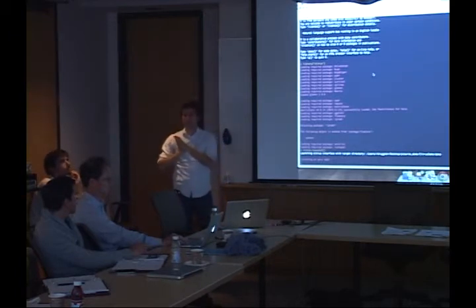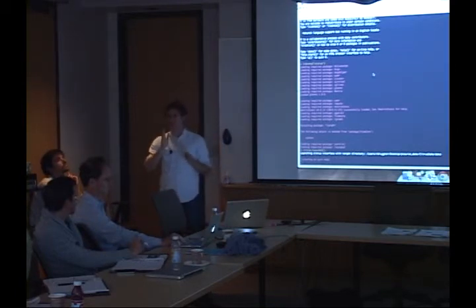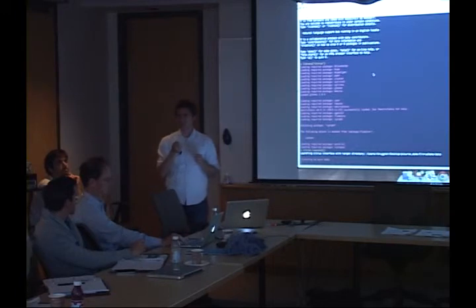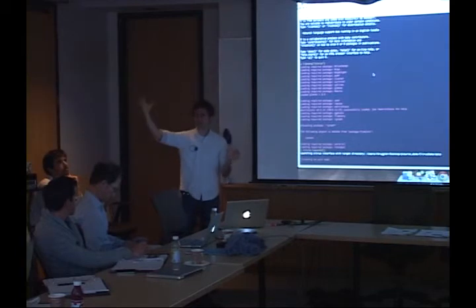I haven't been able to characterize this fully in a statistical manner. My current intuition is that when you're working with things in very high dimensional space, that day-to-day variation actually doesn't make a huge difference in the way things cluster, because the clusters that you're identifying are so unique in this high dimensional space that a little bit of variation in the way these things are measured doesn't make it very close to another cell type accidentally.